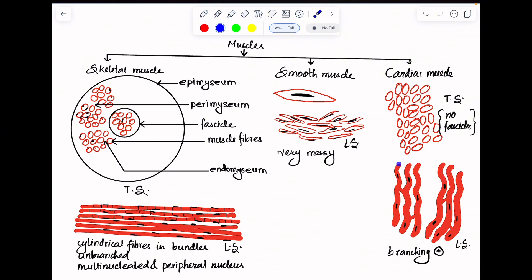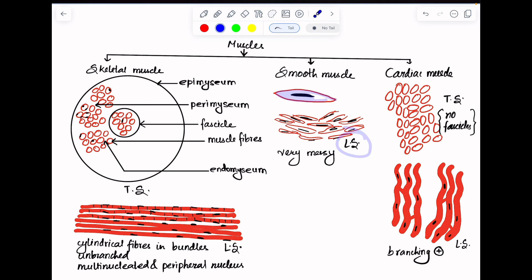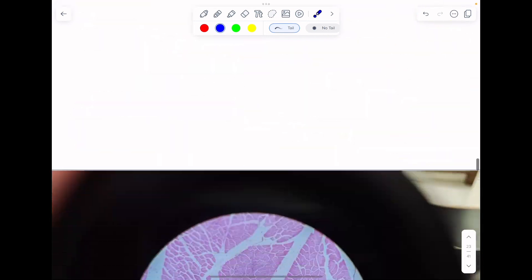In cardiac muscle longitudinal section, you will also be able to see cylindrical muscle fibers; however, the important feature is that they show branching. Under microscopy, you need to observe for these branchings. Smooth muscle, individually, is spindle-shaped in longitudinal section with an elongated nucleus; however, overall they appear very messy.